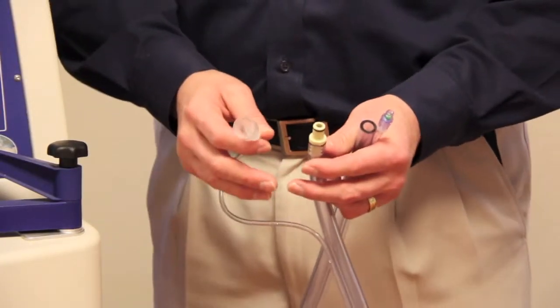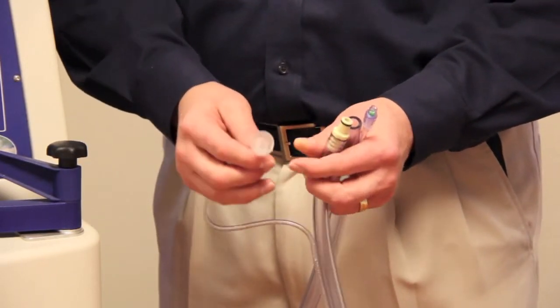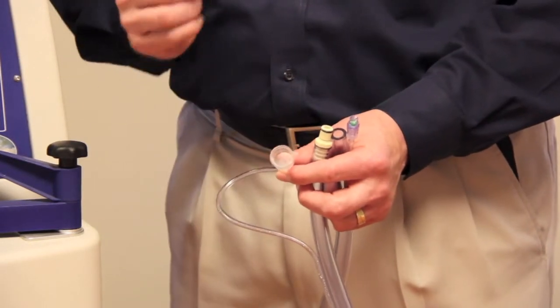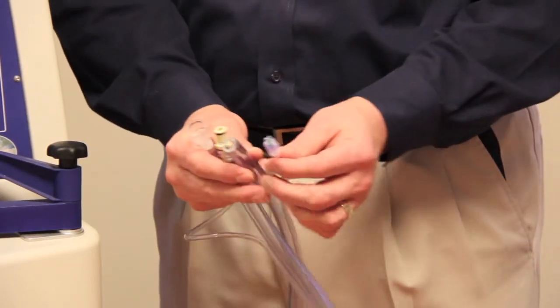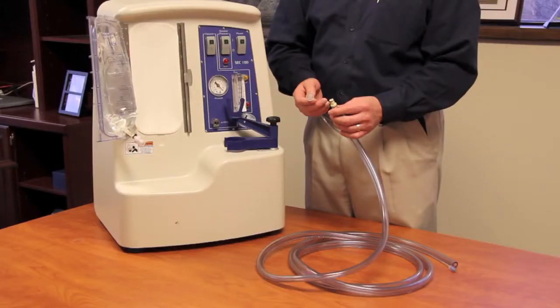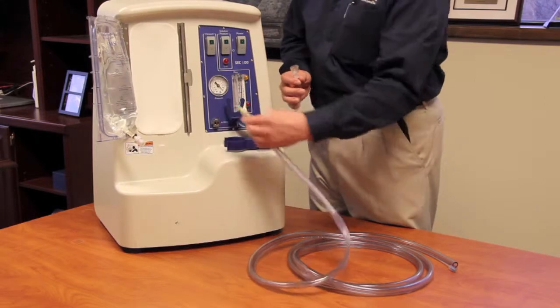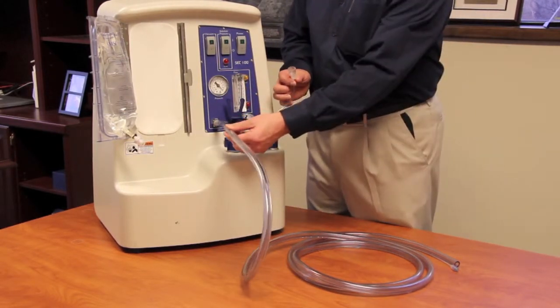In connecting the extension tubing to the system and the bag, there are two points of sterility to note. The first is this cap — there's a spike inside of it that actually penetrates the septum of the solution bag. That's the first point of sterility. The second point of sterility is the solution line that connects to the MVAC. To connect the extension tubing to the SEC and solution bag, you take this fitting and insert it into the quick connect of the SEC. Give it a little tug to make sure it's secure.